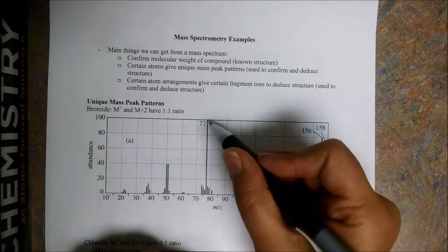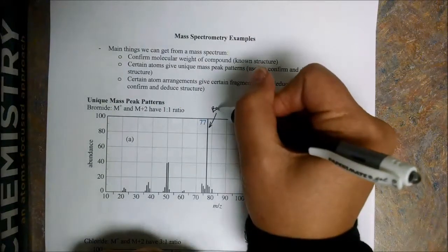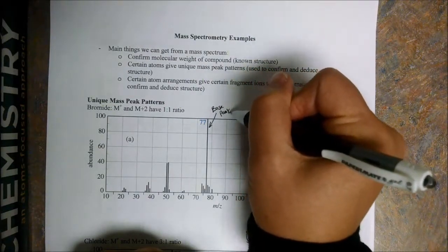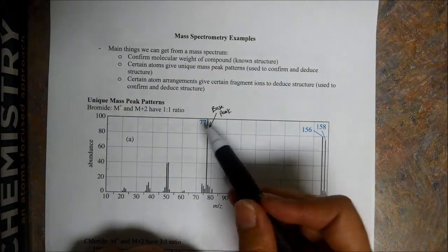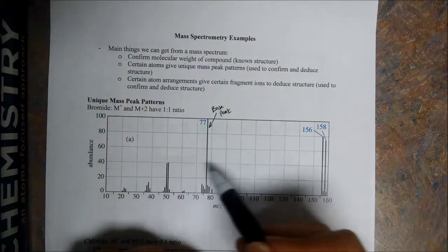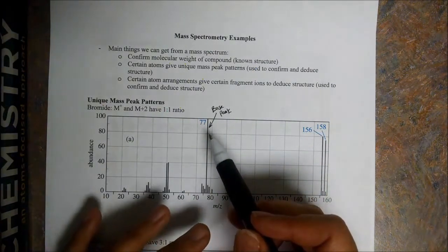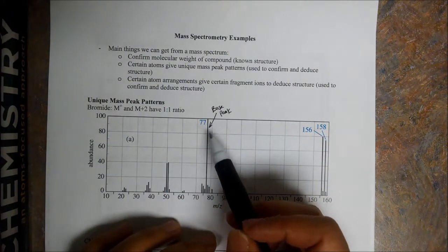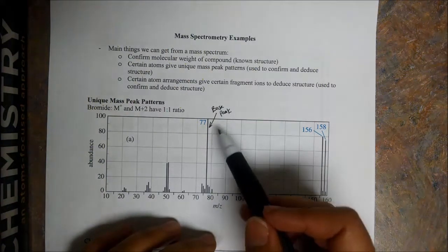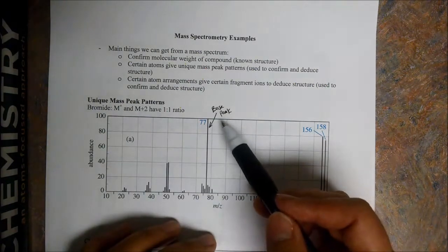Okay, you can see here, this is the largest peak. We call this the base peak of the spectrum. And all that means is we just took the ion of the greatest abundance, just set it to 100, and then everything else is relative to that guy. Okay, so he was just the peak of greatest abundance. That's really all it means. It can help us deduce some things, as in if this is the most common ion, then there's a reason for him to be there. But really just the largest ion, or the ion of greatest abundance, we just call that the base peak.